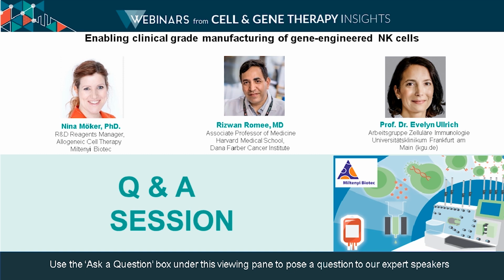I think the Prodigy system is really, really attractive. As Nina mentioned, if we can downgrade the clean level, that will make everybody's life easy. Otherwise, it takes an incredibly long time to manufacture these cells, and is very labor intensive currently. So I personally think that Prodigy and any other similar system which uses closed manufacturing are the kind of things which will be really helpful for both CAR NK cells and T cell fields.